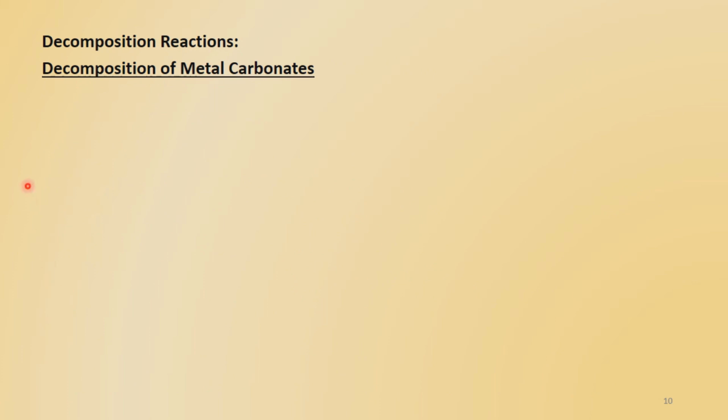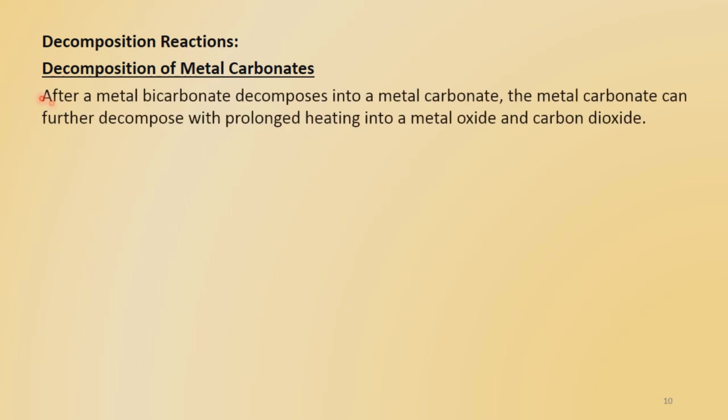All right, the last decomposition reaction we want to look at is that of the decomposition of a metal carbonate. So after a metal bicarbonate decomposes into a metal carbonate, the metal carbonate itself can be further decomposed with prolonged heating into a metal oxide and carbon dioxide.